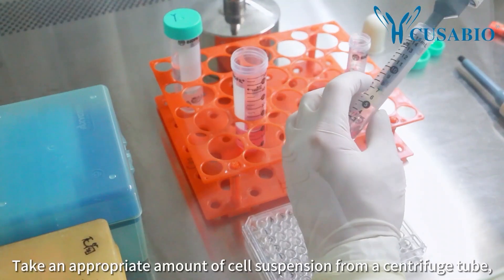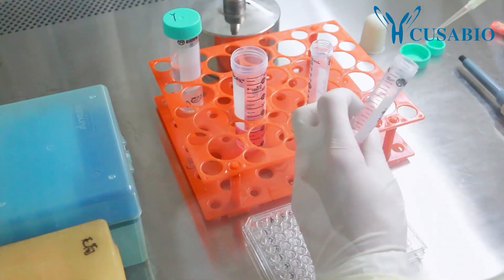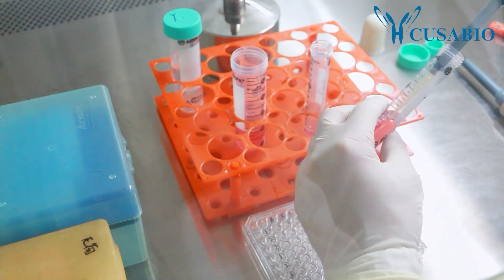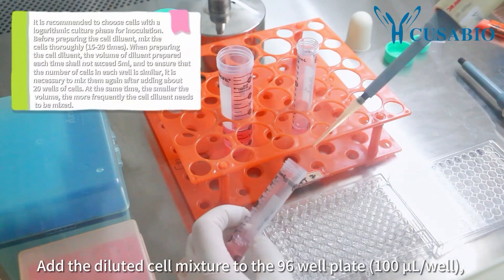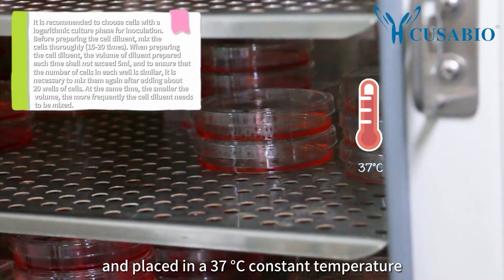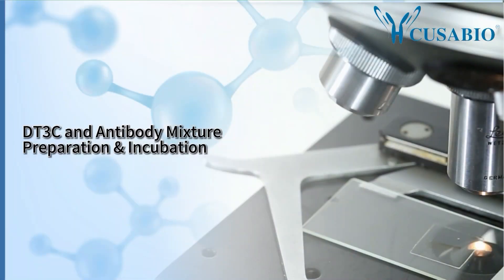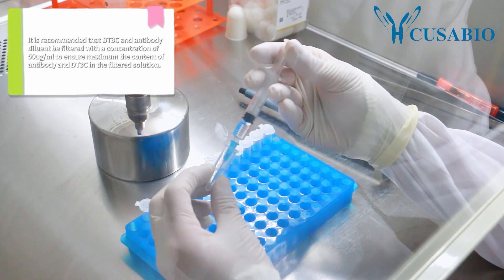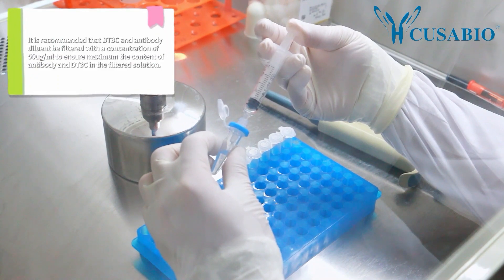Take an appropriate amount of cell suspension from the centrifuge tube and add it to complete culture medium for dilution. Add the diluted cell mixture to a 96-well plate at 100 µL per well, and place in a 37°C constant temperature incubator for overnight culture.